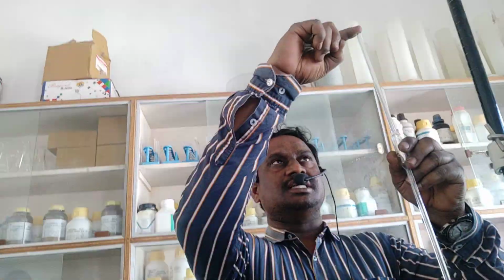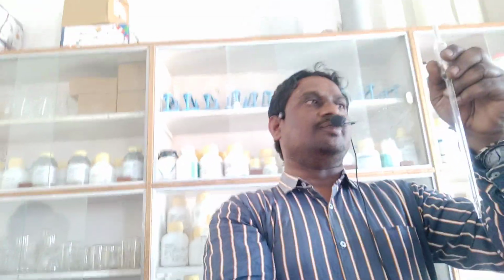Index finger. So after sucking the solution, up to this mark only you have to suck this solution, and your index finger you have to keep here. If you are not keeping this index finger, again the solution will come down.